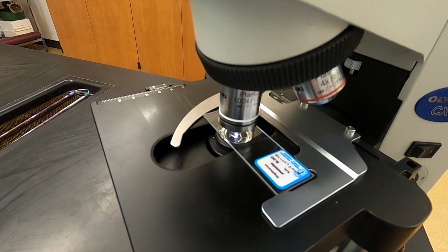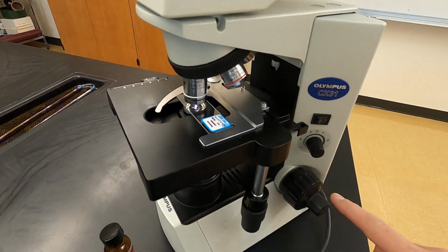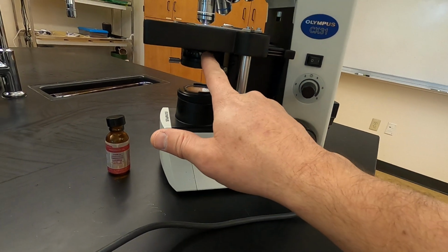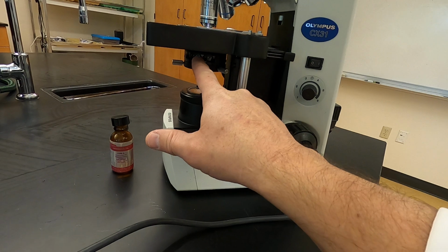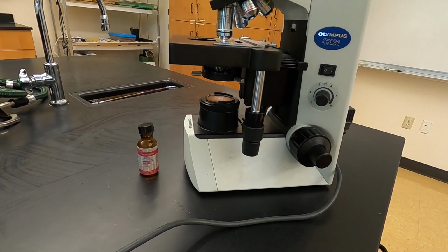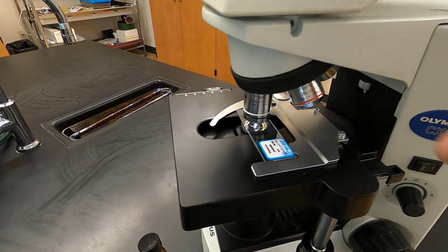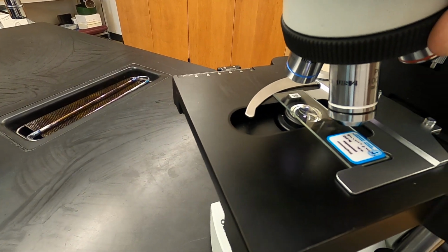into place. Once it does click into place there, now all you would need to do is adjust your fine focus, perhaps your light level, and then your contrast by opening or closing your diaphragm here to get the light level and to get the right contrast that you want to be able to see your sample. Again, as a warning, once we've started using oil immersion, we cannot move this back to the 40x objective. That is not what you want to do.